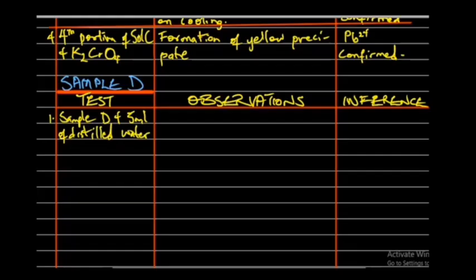We discovered that there is a formation of colorless solution. This also shows that the substance was soluble. Soluble salts present.